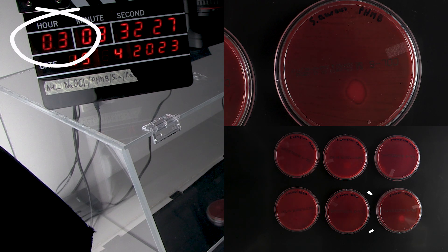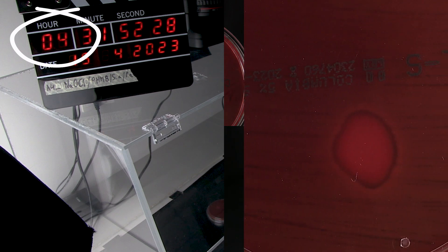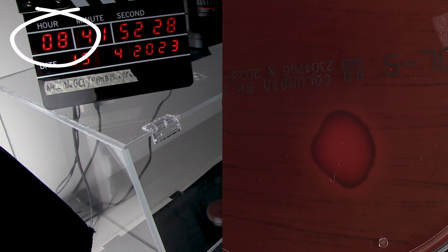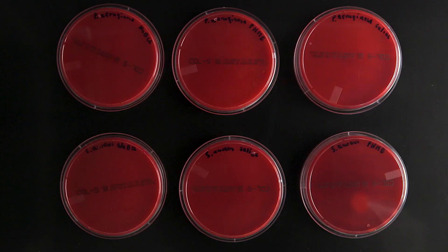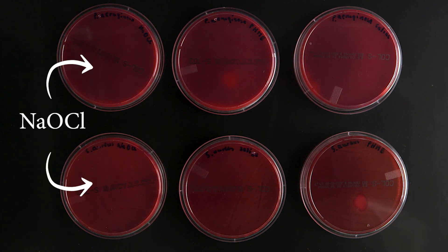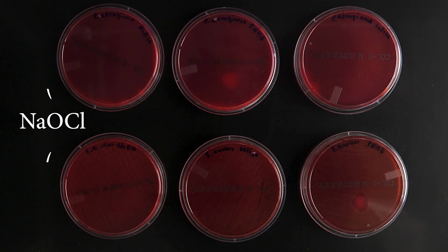As you can see, the only visible inhibition zone is around the drop of polyhexanide. There is no inhibition zone around the low-concentrated hypochlorite.